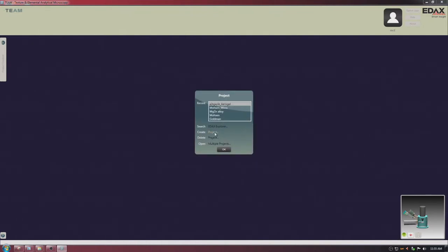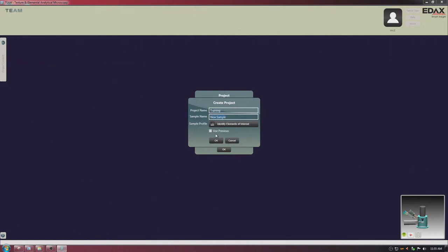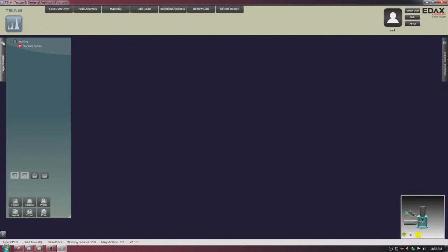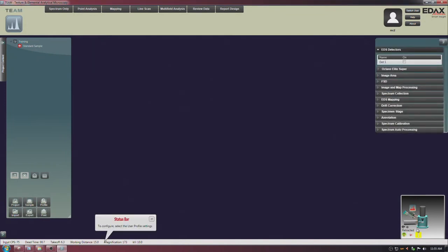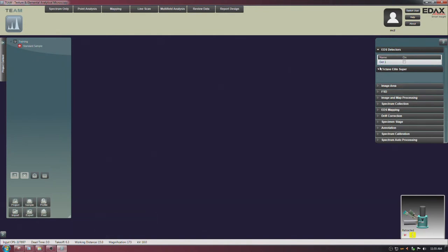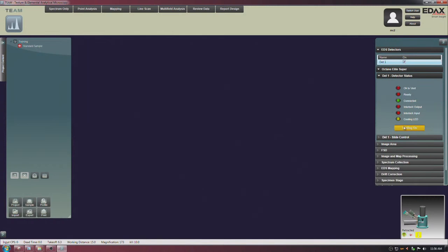Here are a lot of project names. We're going to create a project called training; our sample is the standard sample. On the data tree on the left I now have the project name training and standard sample. I need to do a couple things before I'm ready to collect data. First, I can see the detector is not cooled down, so I'm going to double-click to begin cooling the detector. I'll select cooling on. This is a silicon drift detector — an SDD — and it needs to be cooled by a Peltier cooler so we don't damage it when we hit it with x-rays.